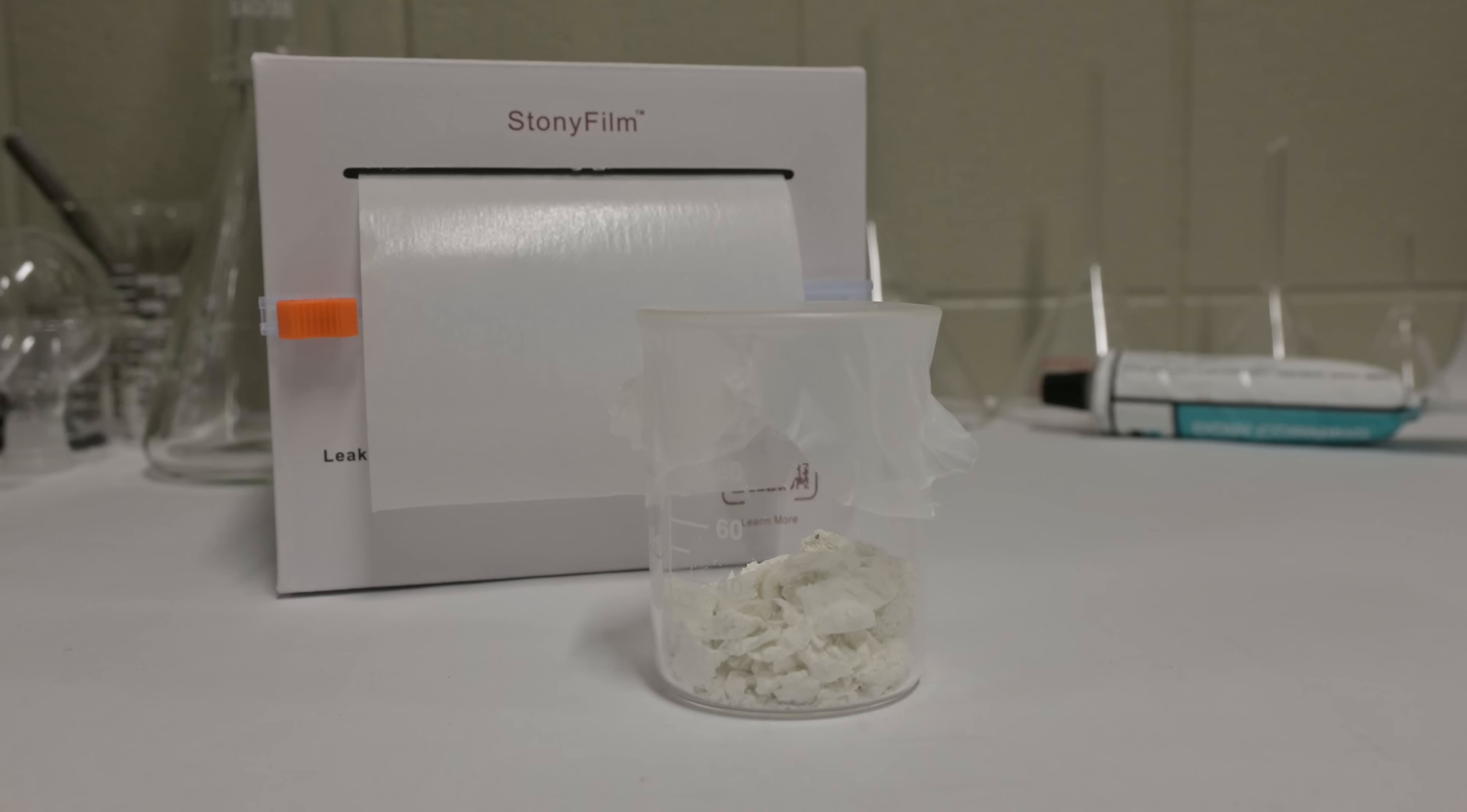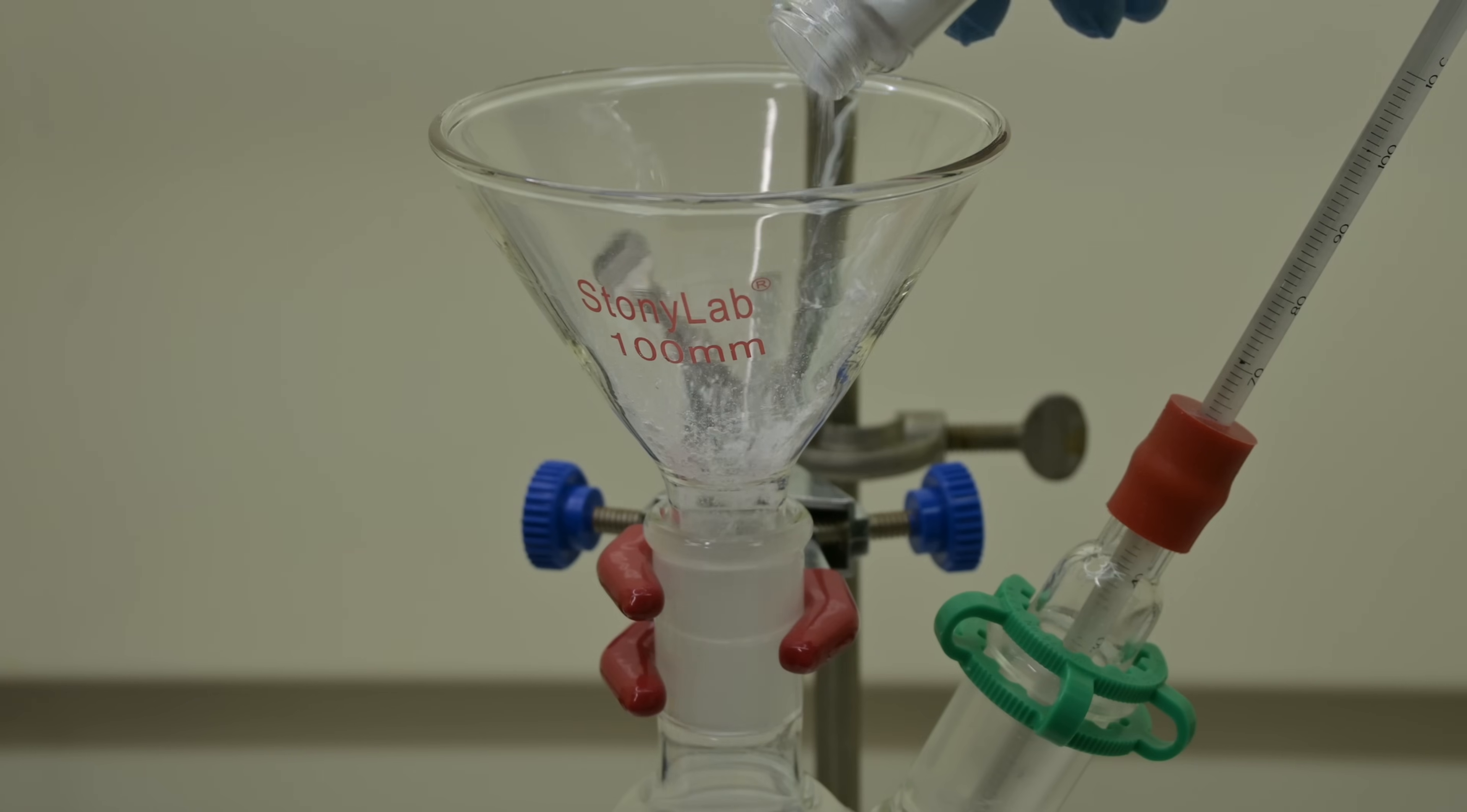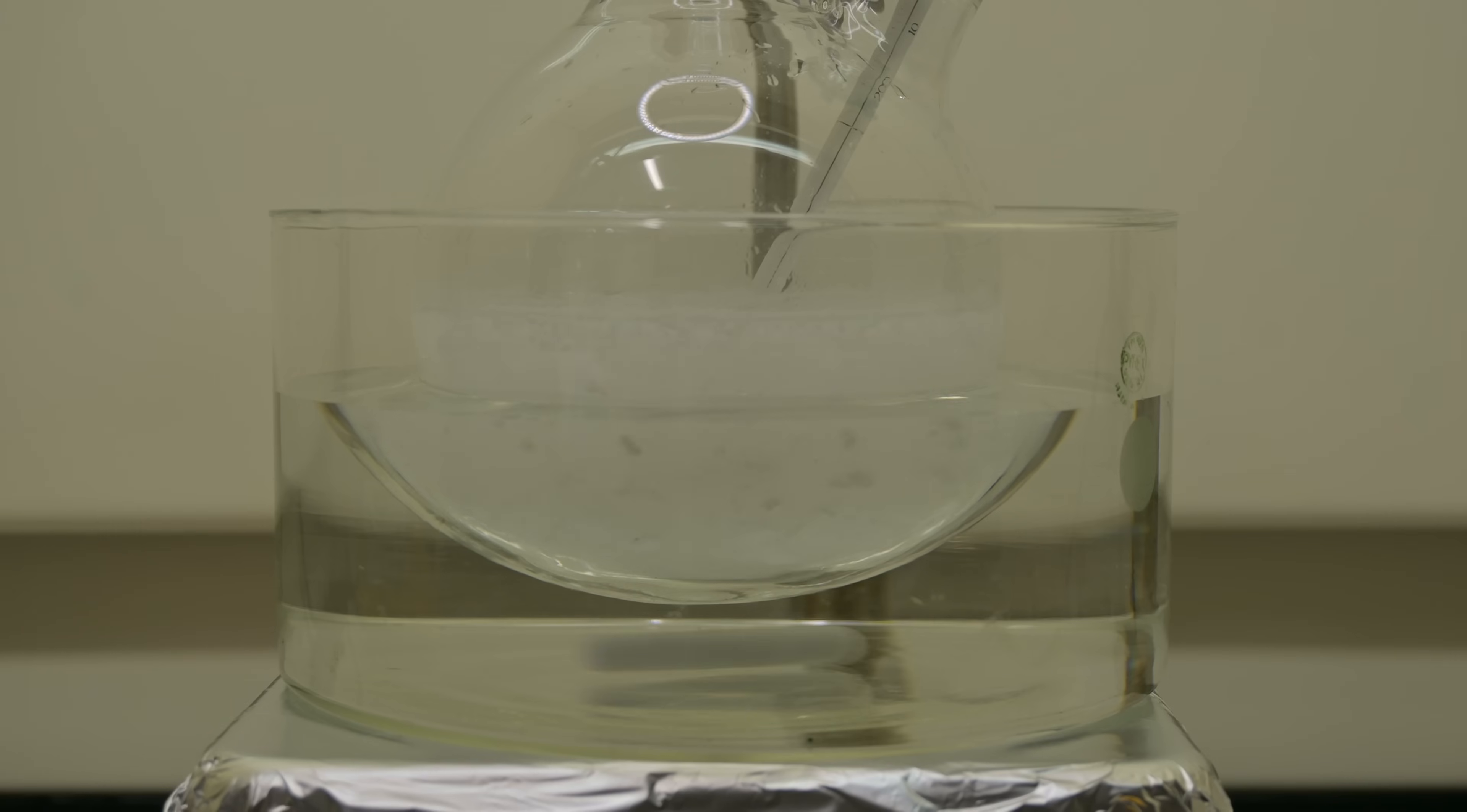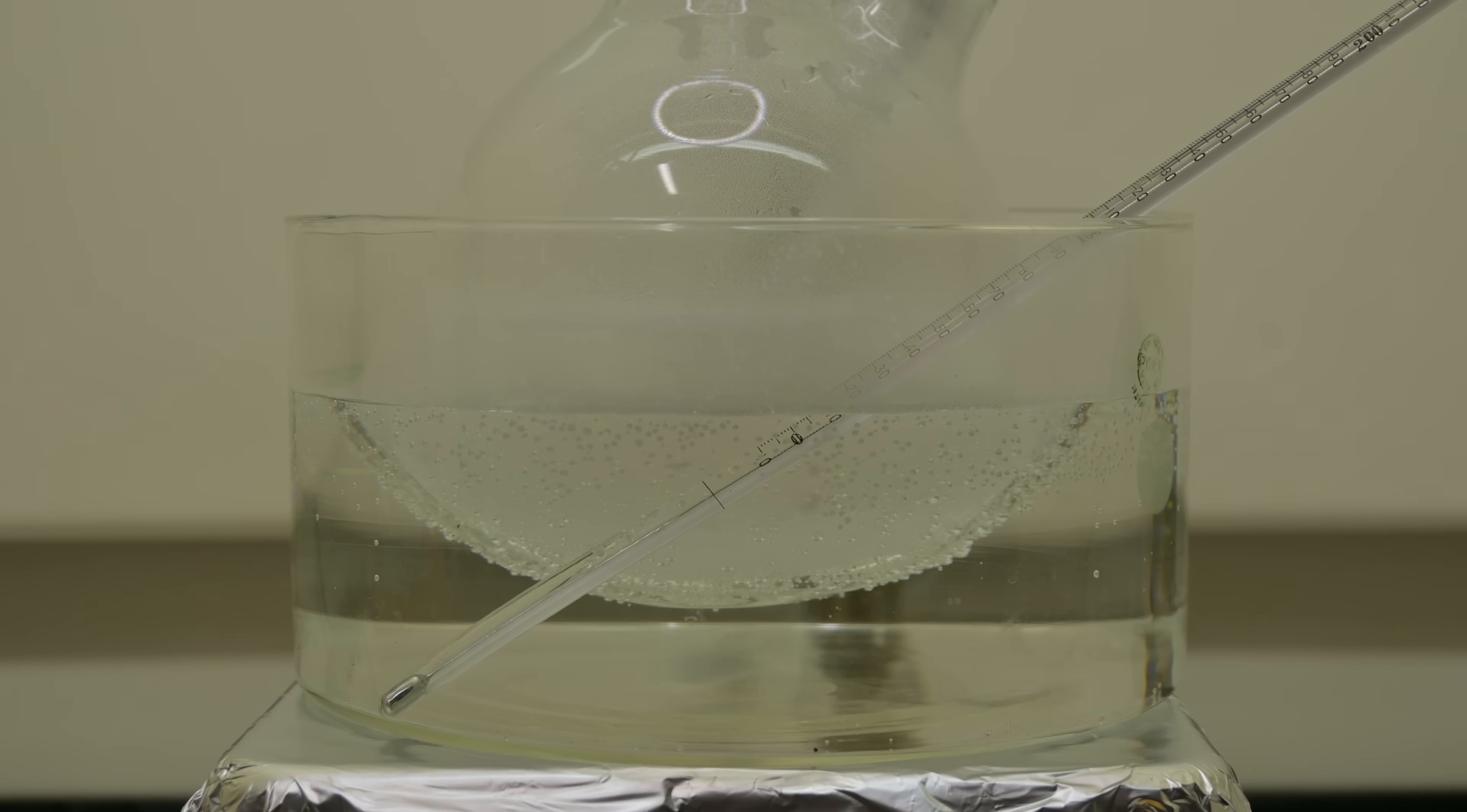Now we're going to take this product and transform it into p-acetaminobenzoic acid. I begin by adding 6.1 grams of our previous product into a 1L round bottom flask, followed by 16.3 grams of hydrated magnesium sulfate and 400 milliliters of distilled water. I set the flask onto a steam bath and bring the mixture up to about 85 degrees Celsius. It's important to use gentle, even heating and not to let it boil too hard, just enough to keep things hot and fluid.